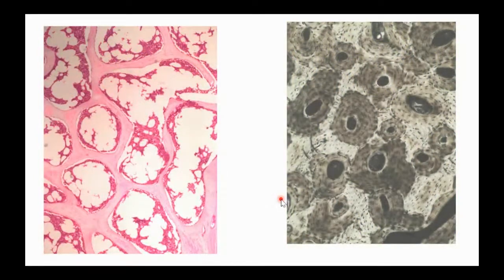Let's talk about the tissues that I turn my hyaline cartilage into. So hyaline cartilage, again, is what we make the fetal skeleton out of. We turn it into bone tissue as we're developing in utero and then after birth. So there are two kinds of bone tissue. The kind of bone tissue over here on the left that we see these open spaces in, this type of bone tissue is called spongy bone tissue. Over here on the right, we're looking at compact bone tissue.